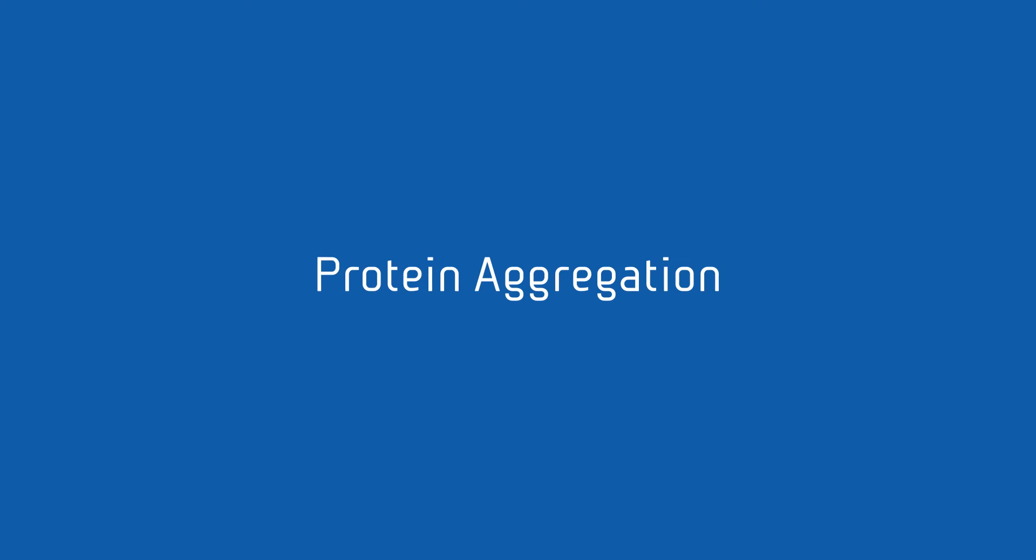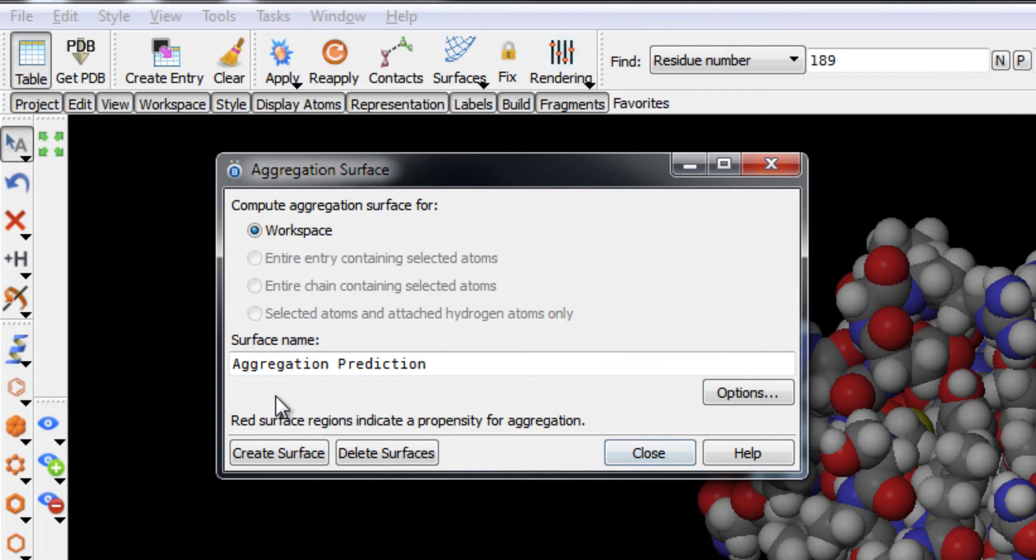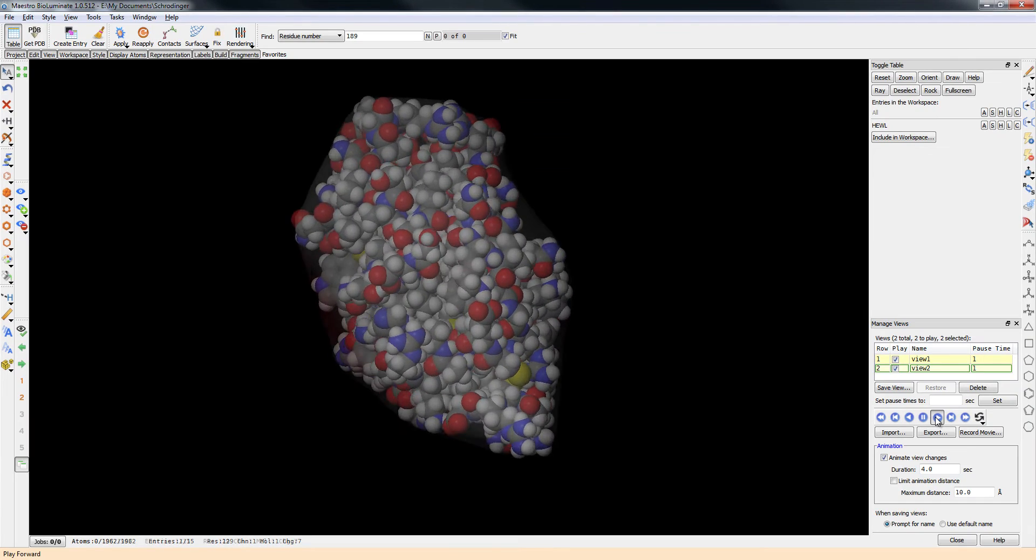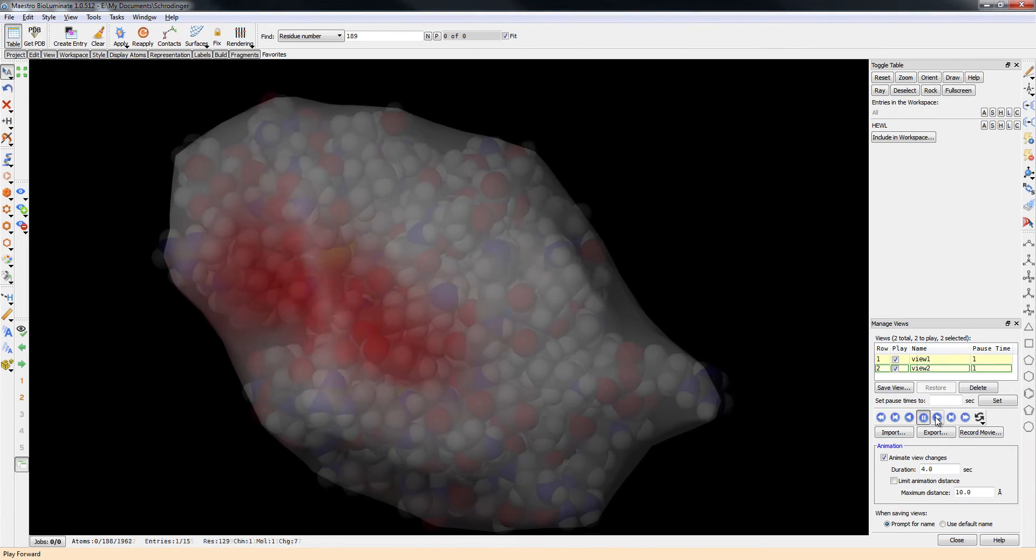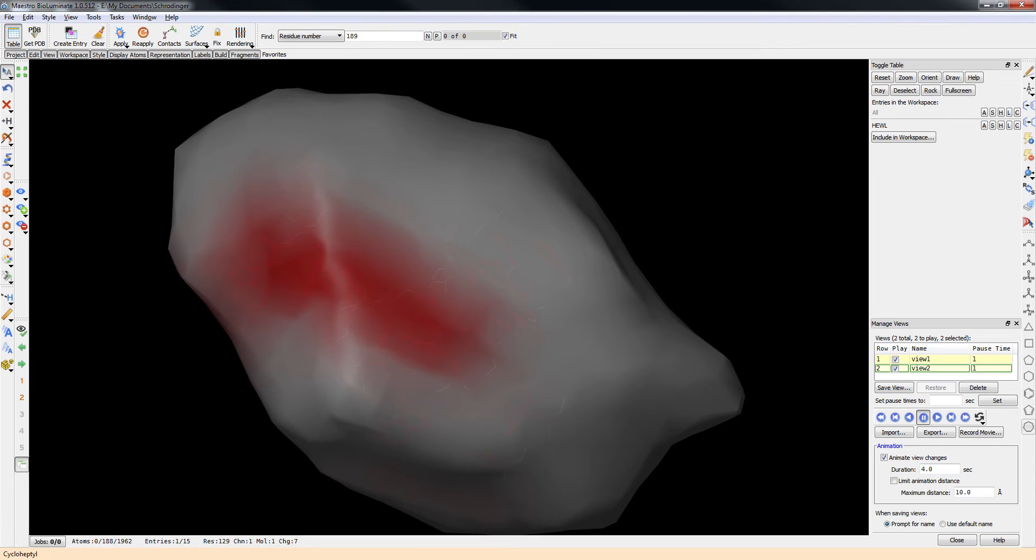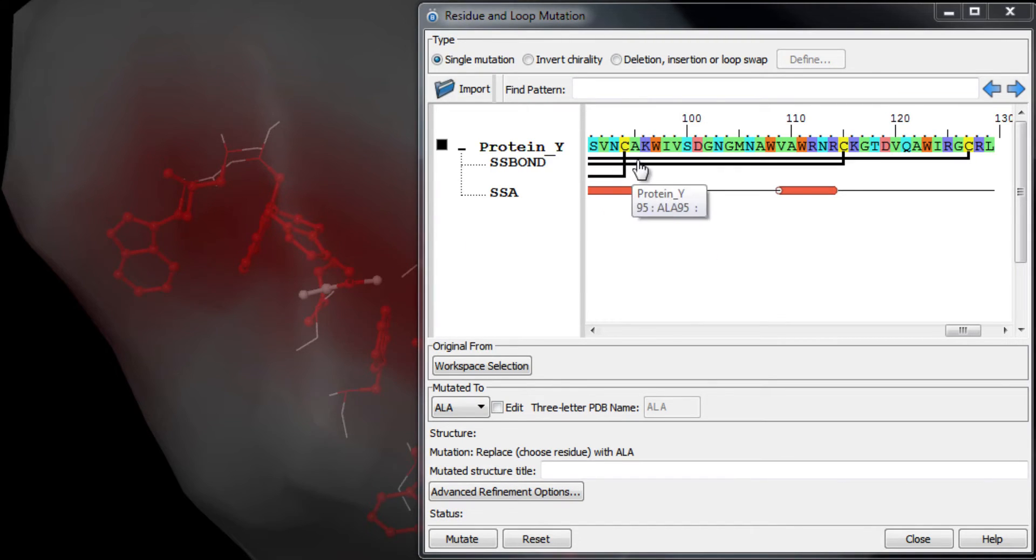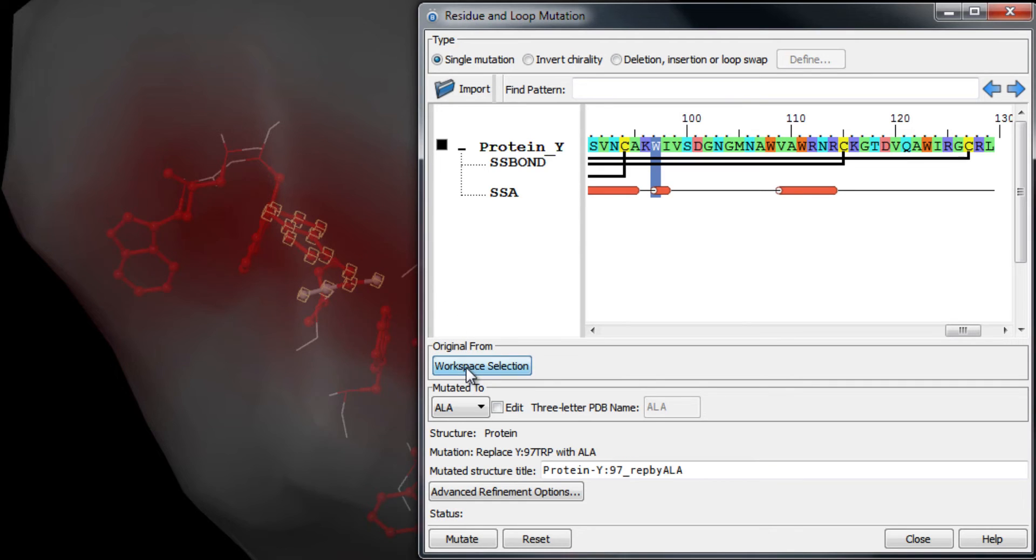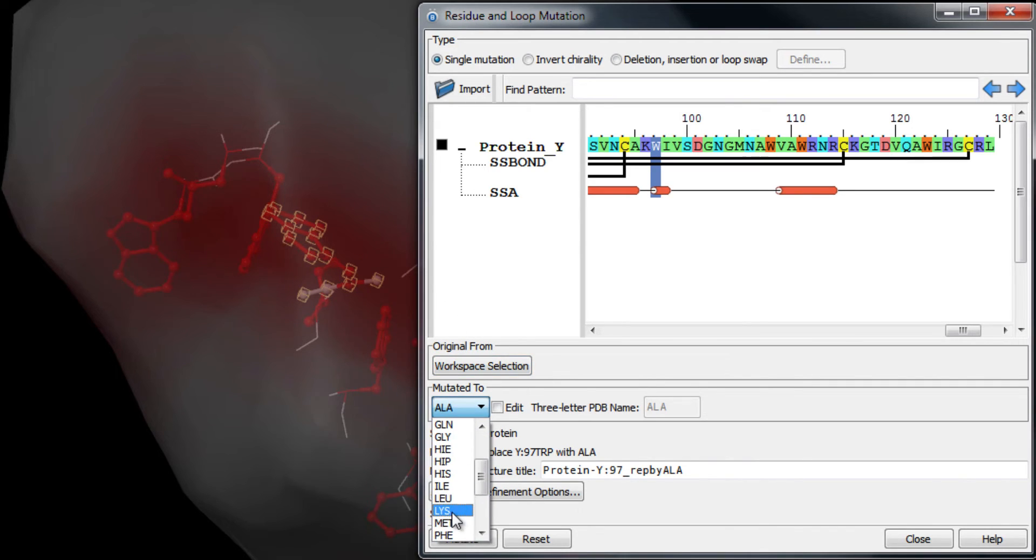Generate protein aggregation propensity surfaces to locate aggregation sites that often occur around hydrophobic regions. And use the residue and loop mutation panel to mutate these regions to hydrophilic residues to reduce the tendency to aggregate.